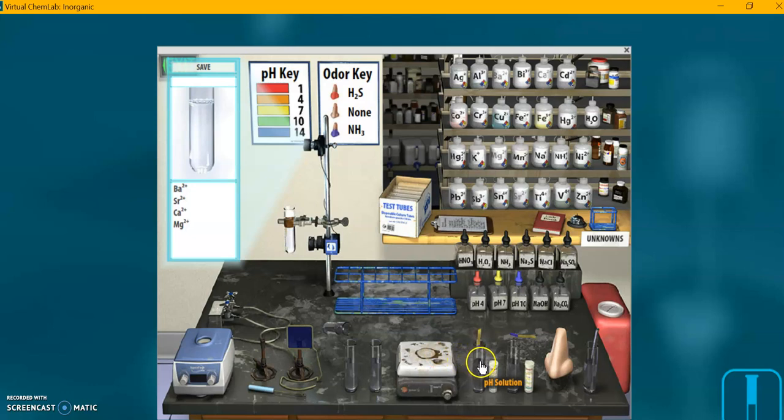pH solution. If you click on that, I'll click on that right now, you can see over here that on the test tube stand a piece of pH paper appears like right over here. And it indicates what that pH is.